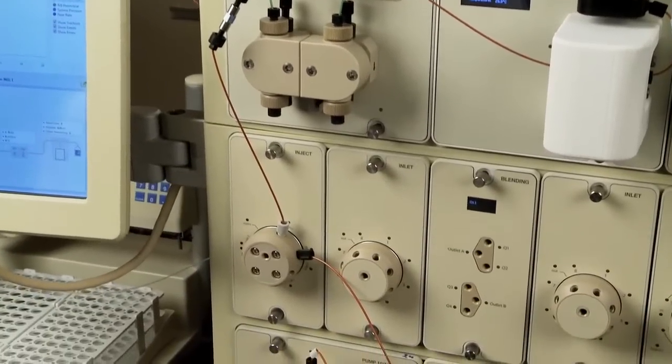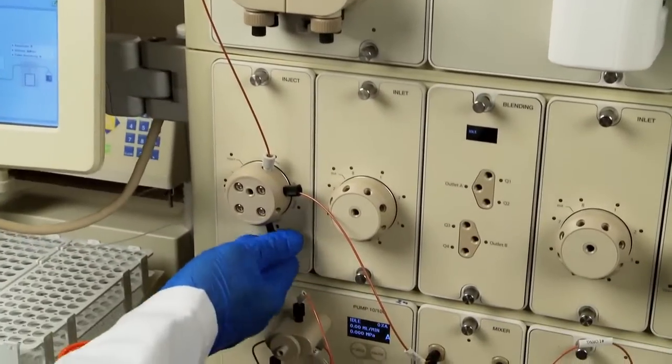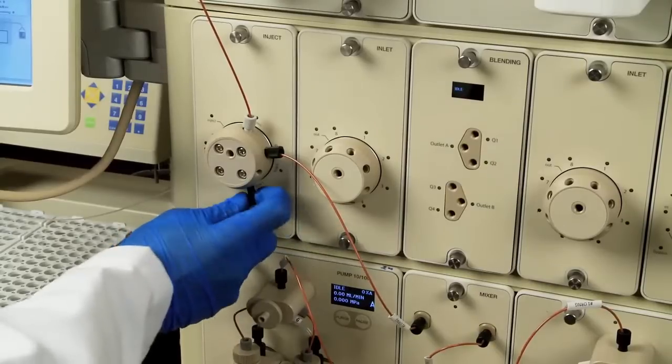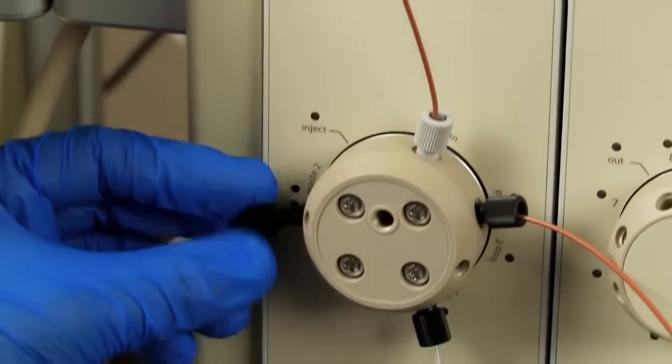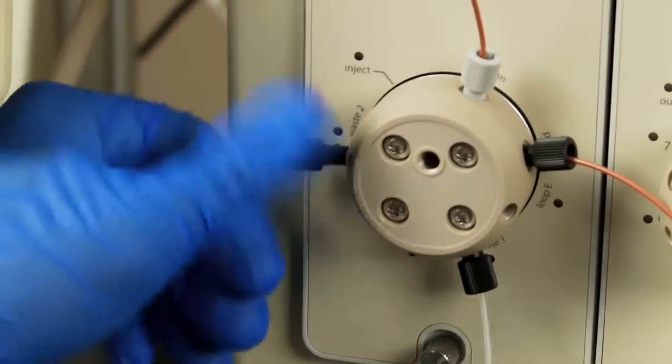Now you will make tubing connections to the inject valve. Connect the waste lines to waste ports 1 and 2 on the inject valve and place the ends into the waste container.